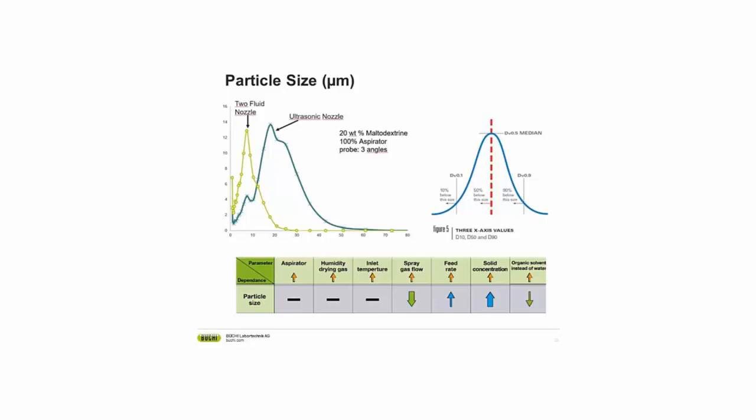So we are physically constrained by the size and the path of drying we have. If we are talking about bigger particles, we need a longer drying length and a wider drying chamber as well. Then we are talking about a pilot scale unit. So really, if you want anything above 60, you would have to swap to a pilot scale unit.